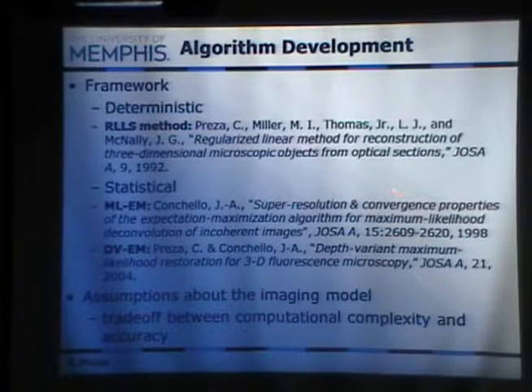And then as you move down to this algorithm where you have multiple points per function, 10 or 20 or however many, then the requirements even grow linearly by the number of strata that I mentioned. So it scales linearly by capital L. So this is another reason why it's only in recent years that we have been able to do a lot of these computations.